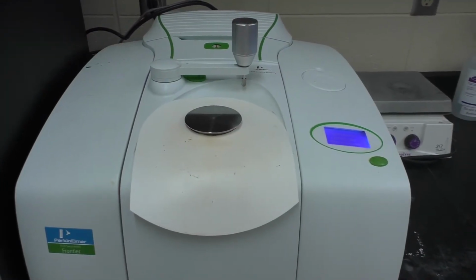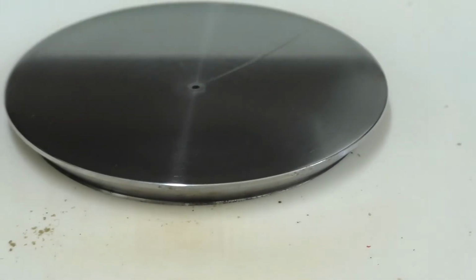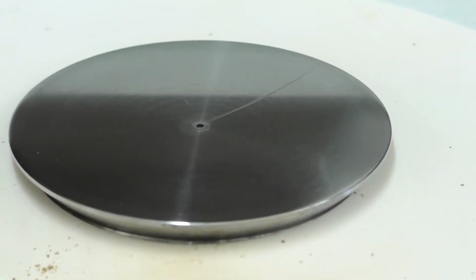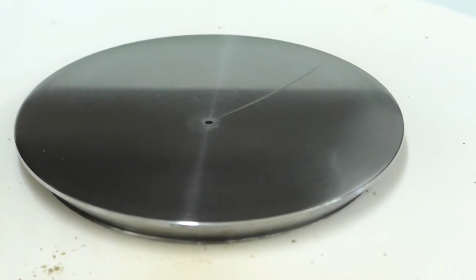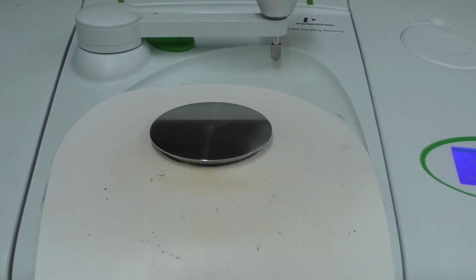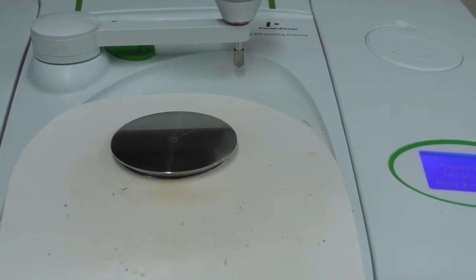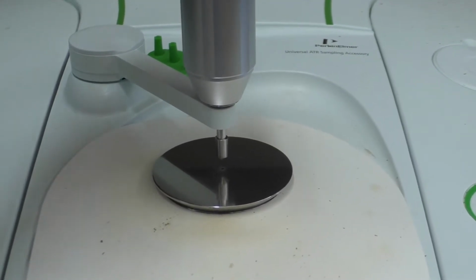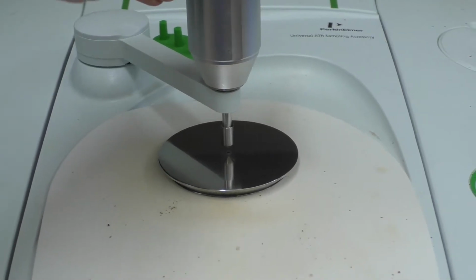So here's a close-up of the spectrometer itself. You can see the little hole where the crystal is and where we would place our sample. If it's a liquid, we simply have to drop a small puddle of liquid material onto that hole so that it comes in good contact with the crystal. If it's a solid, we need to place a little pile of sample on there and then use the arm that's shown right here. It will come across and can be tightened down to carefully pack the solid sample onto the crystal.